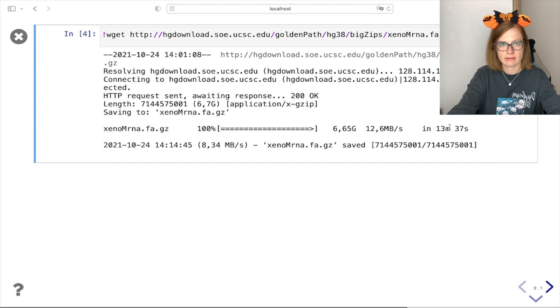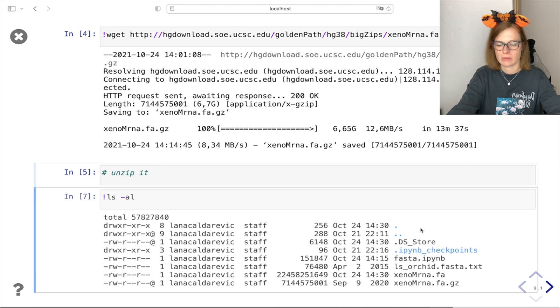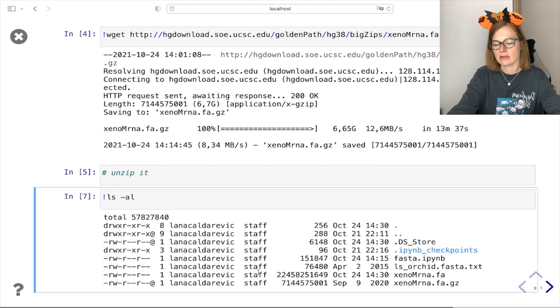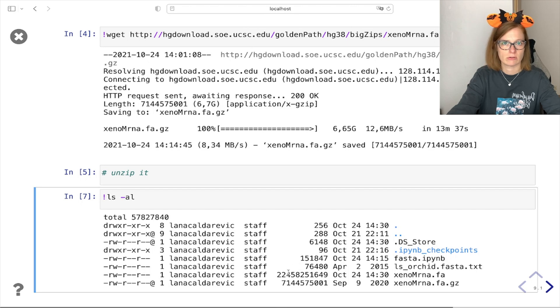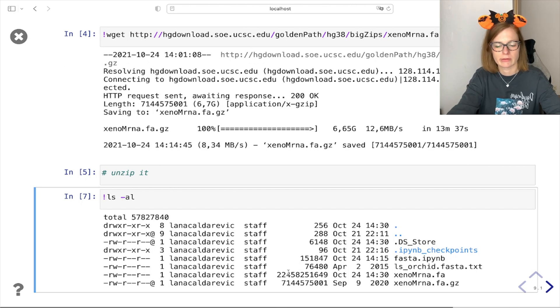After the file is downloaded we need to unzip it as it comes zipped. We can see here that the unzipped file has around 22 gigabytes which is probably more than fits into our memory.